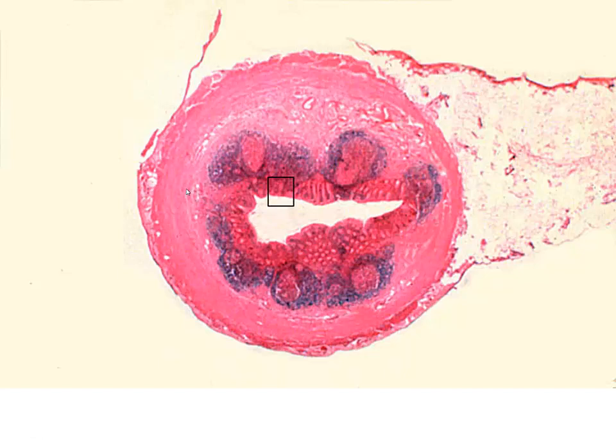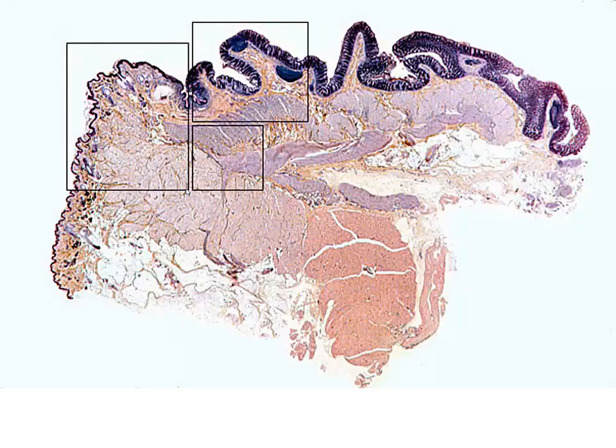Now, as we get to the end, we get to the rectum. The anus is the opening, and what we're going to see is another transition similar to what we saw with the lip. So in this case, we have our colon material coming from the right. We have our typical colon type epithelium, the mucosa. Here we have our submucosa, lamina propria, muscularis.